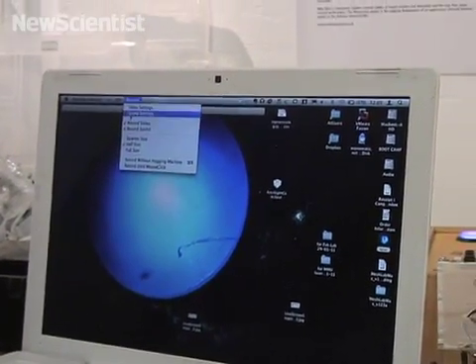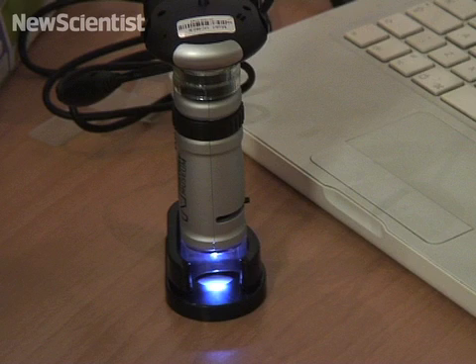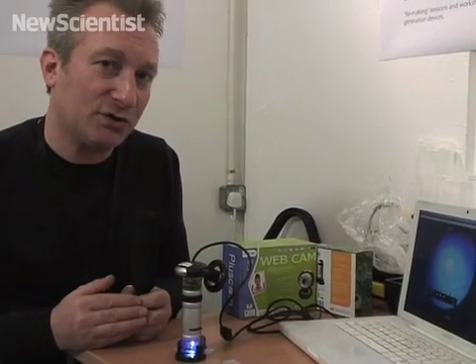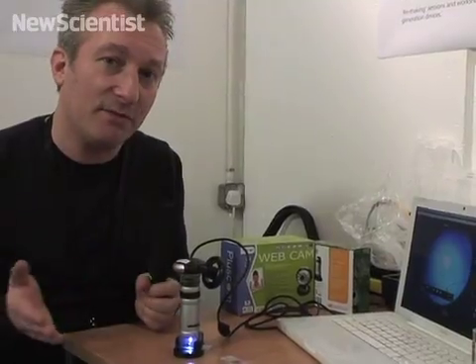You can actually record this as a video. So I'm going to start recording — mouse click and there we go. So there you have it. You can now not only make your own USB digital microscope for about £15, but you can also, with a piece of software, make your own digital microscopic films as well. So there you go. Enjoy.